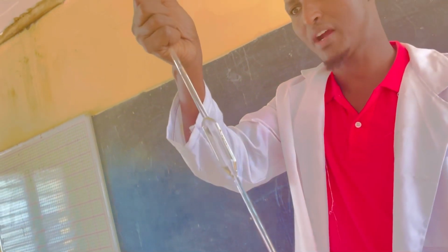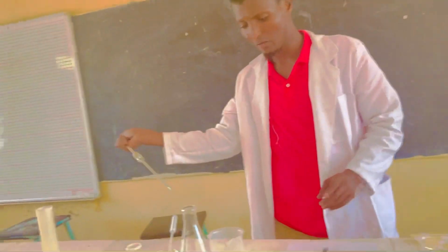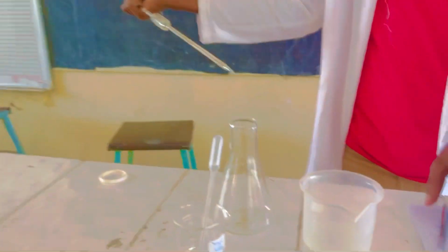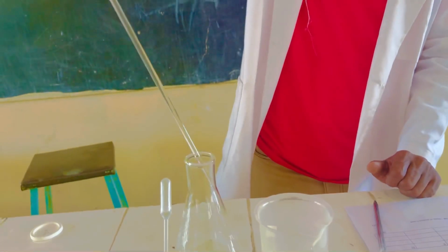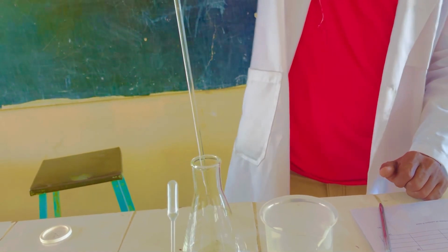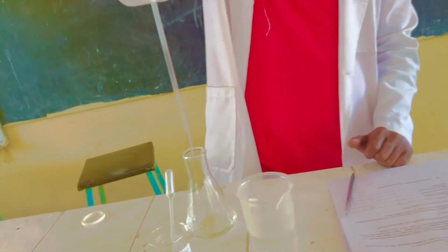So this is I pipetted to the beaker. Then I will transfer to a conical flask.